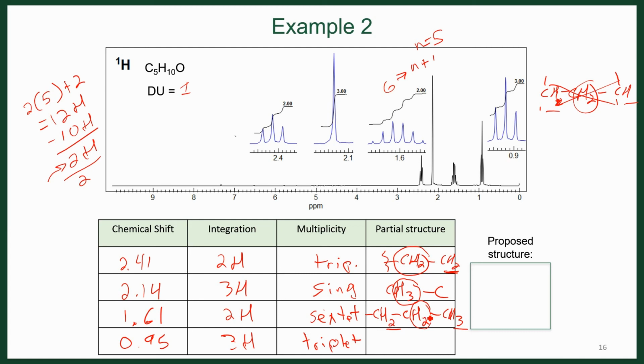and then we have a CH2 on one side that gives 2 of the coupling values, and then a CH3 on the other side that gives 3 of the coupling values. All right, and we can begin to see that this is going to fit with our top partial structure that we had for this signal here.